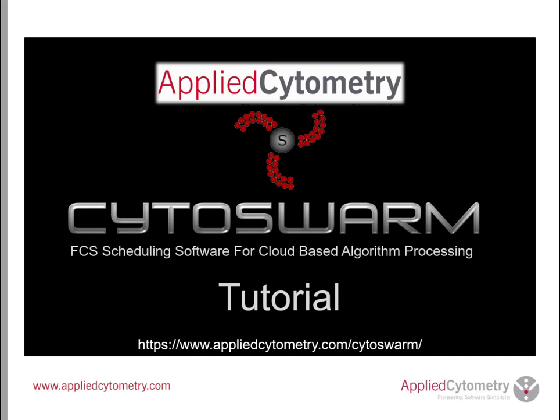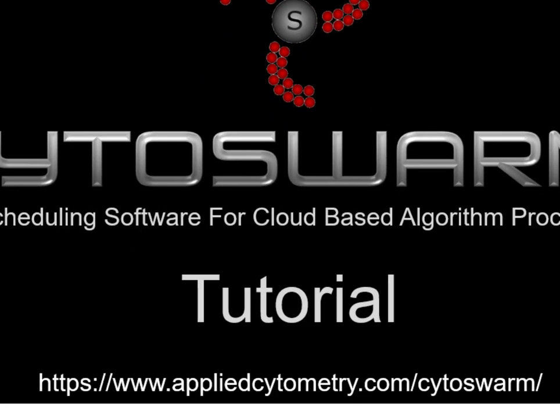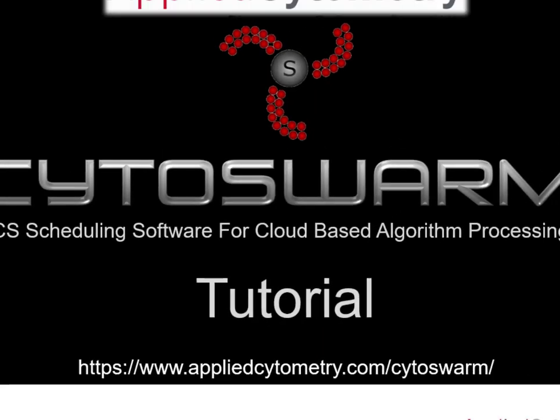This tutorial has been made to introduce you to CytoSwarm and help you get started using the software. If you would like to know more, please visit the website below, and you will also find links to the installation guide and the user guide here too.